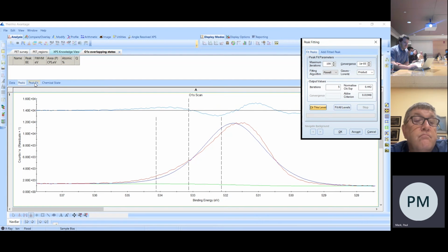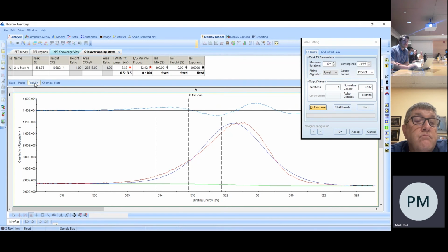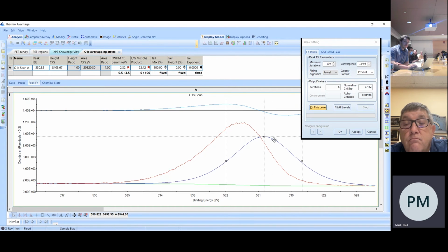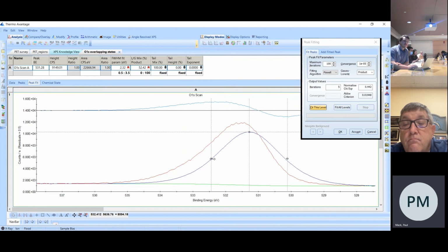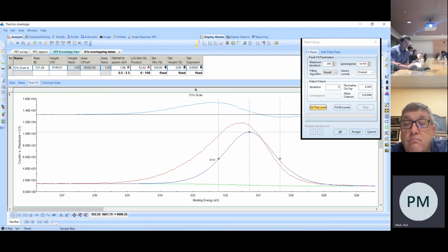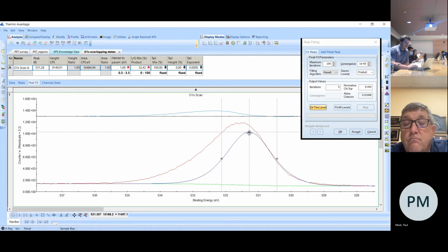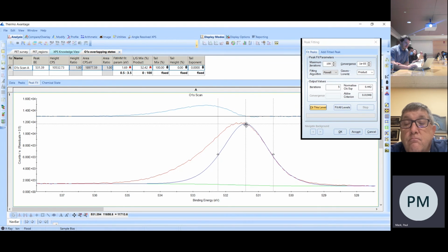Okay, go to the peak fit tab again. Now, if you click where it says A on the left-hand side, you'll see these little boxes again appear on your peak, and you can drag it around now. You can drag it, you can change the width. So I'm going to put that peak on the right.